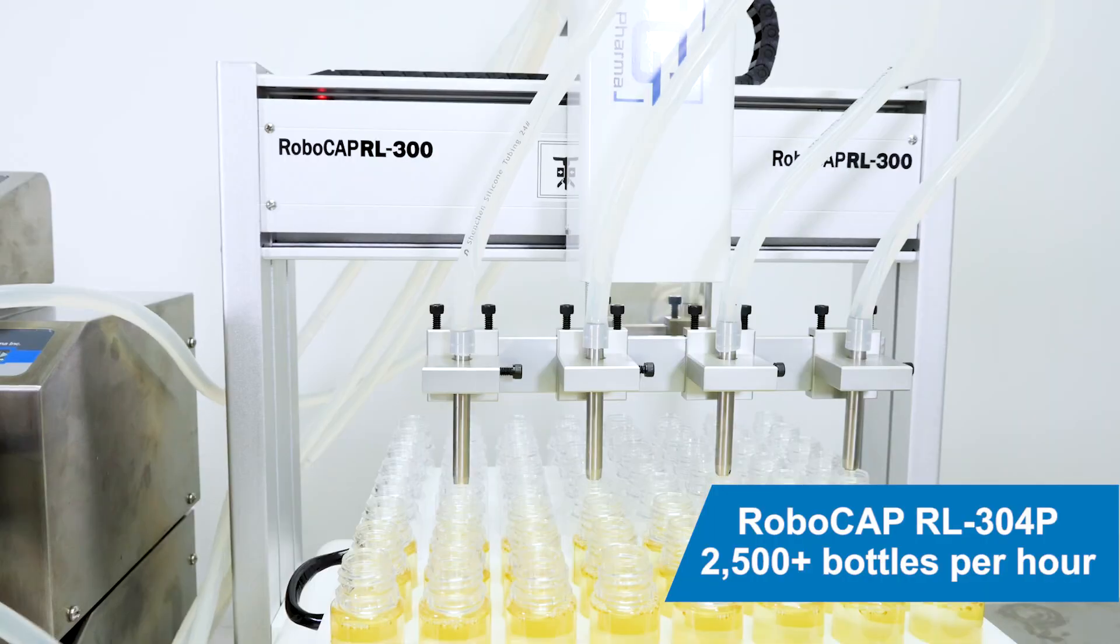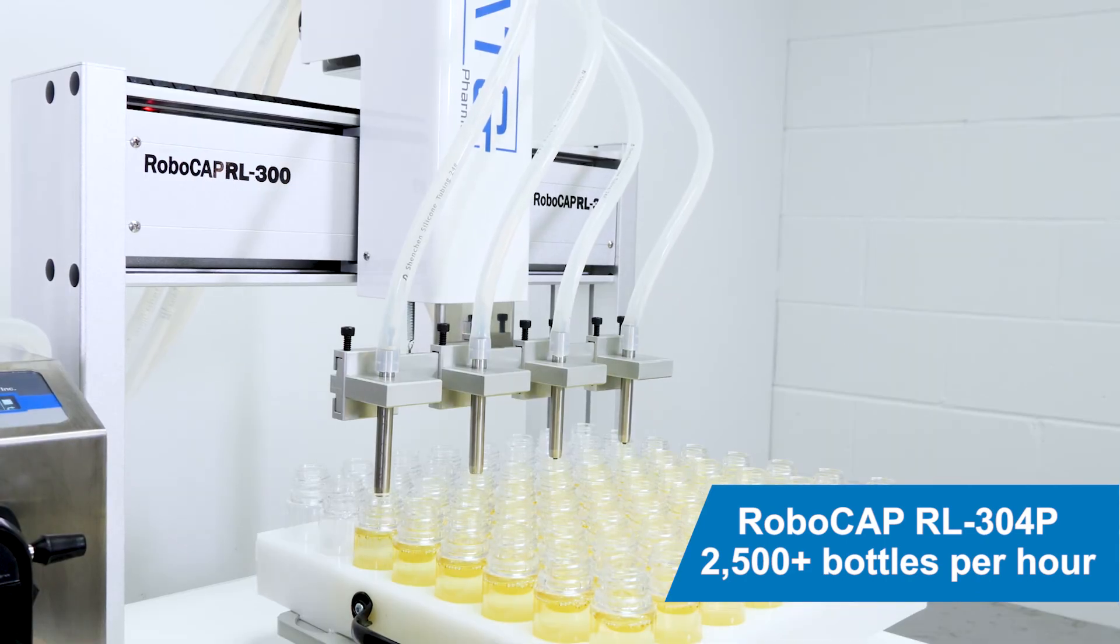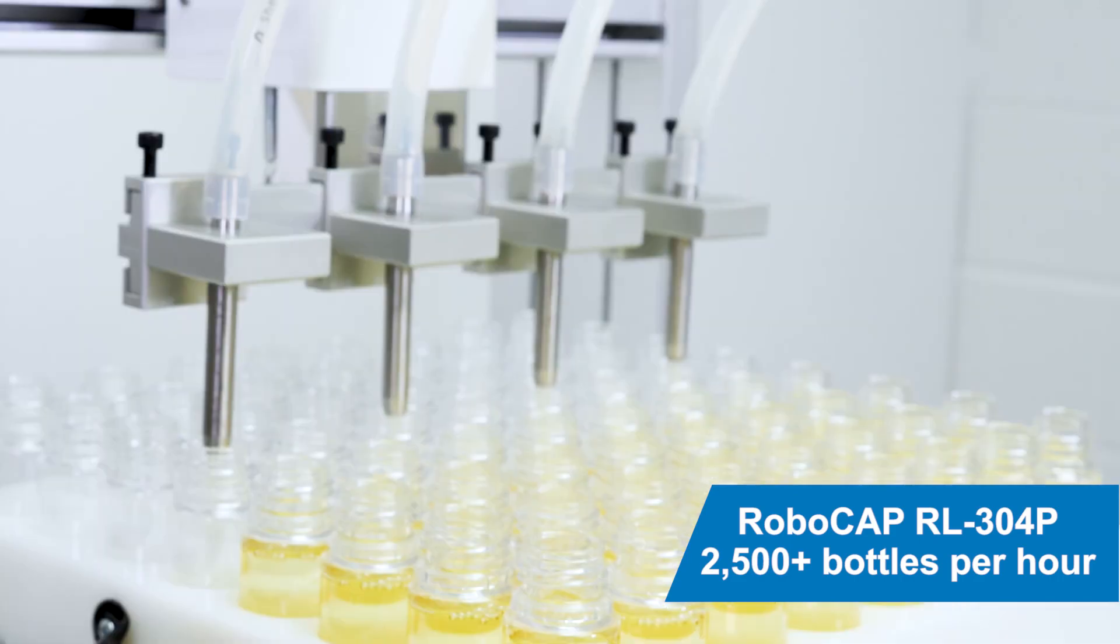The benefits of the RoboCab 300P series is that you do not need a pressurized system to dispense your product. The only product contact parts are the nozzle tip and the product tubing.